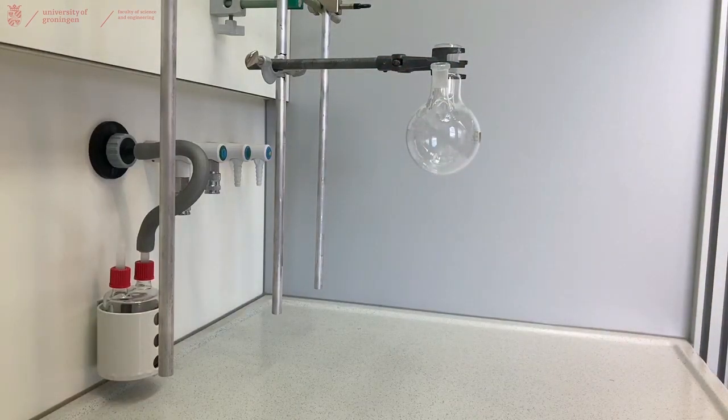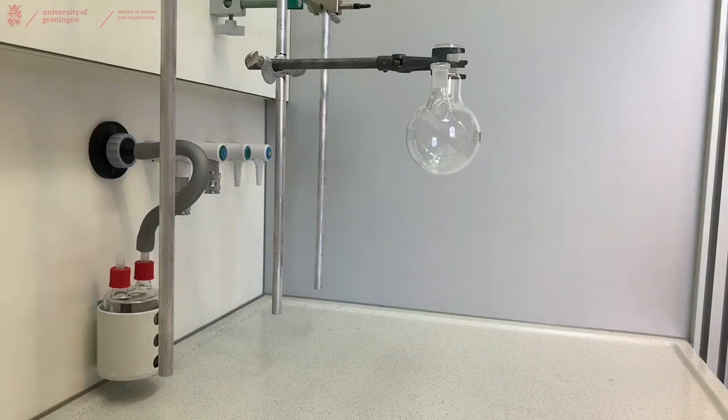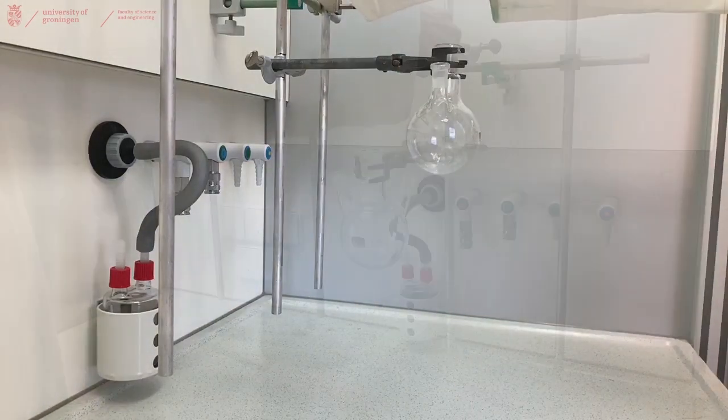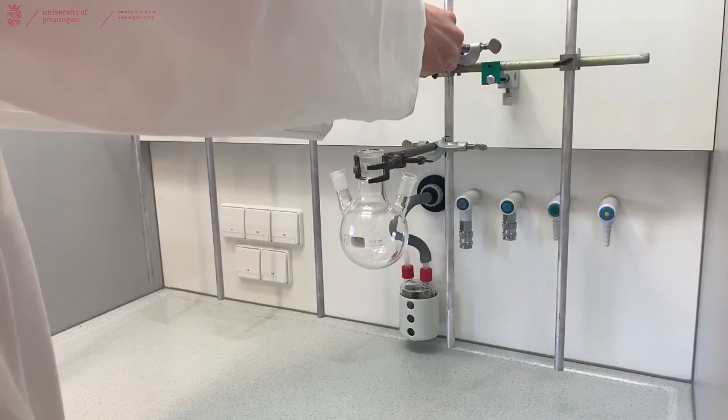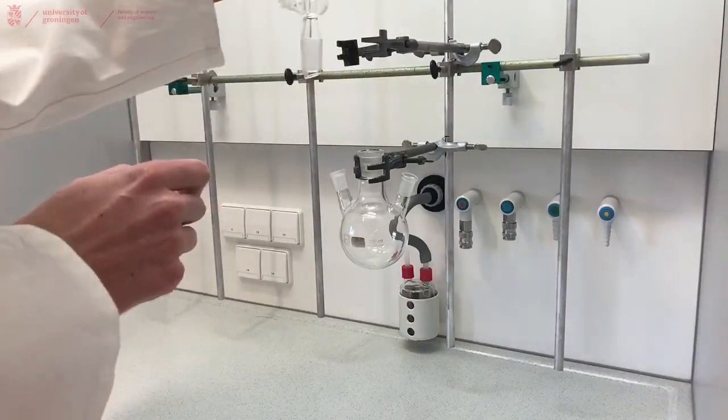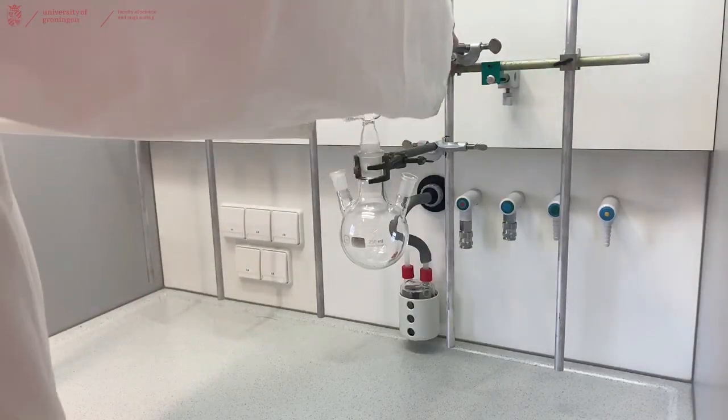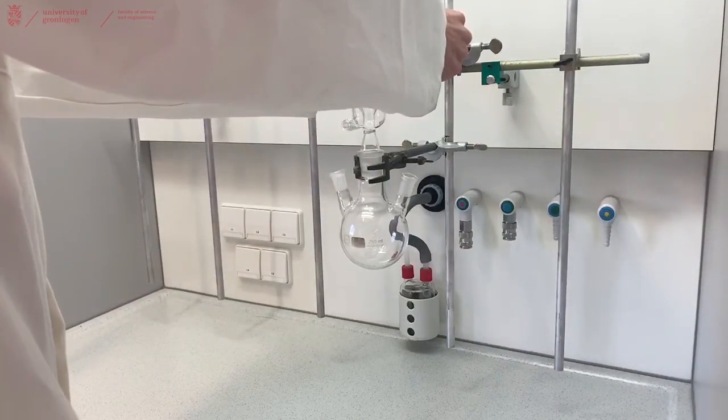Now place the cooler with the clamp on top of your three neck flask. The cooler should just sit in your three neck flask and the clamp is only there to support it and prevent it from tipping over.